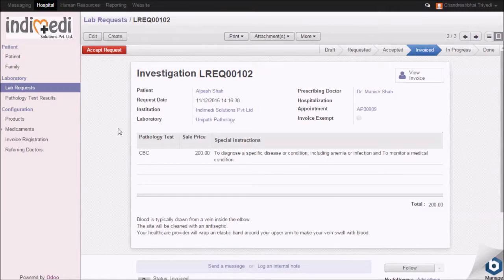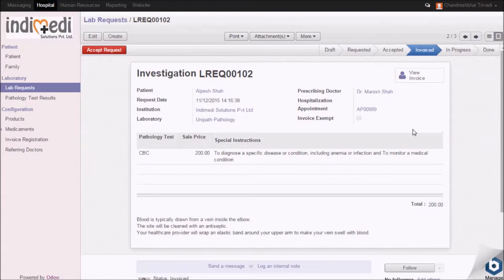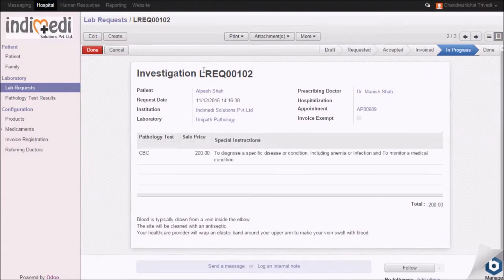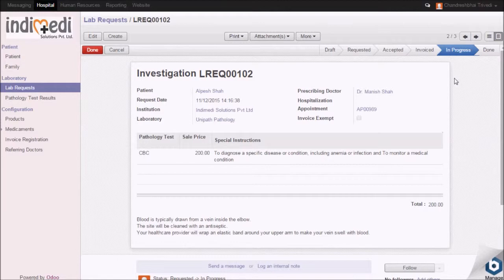You will get a display of lab requests prescribed by a doctor. Accept the request. You will see that request has moved to in progress stage.